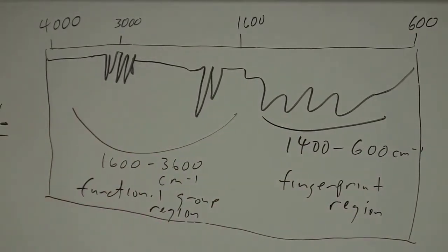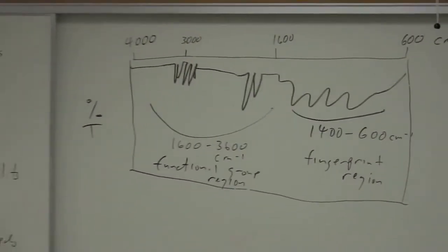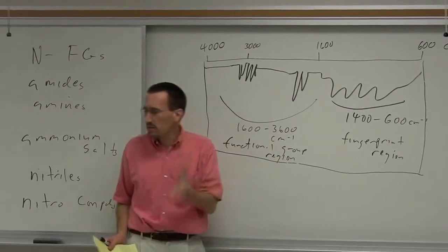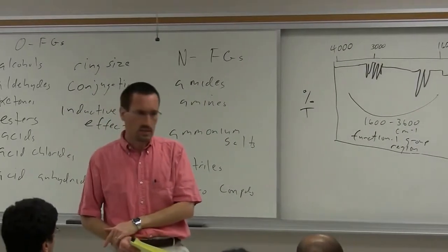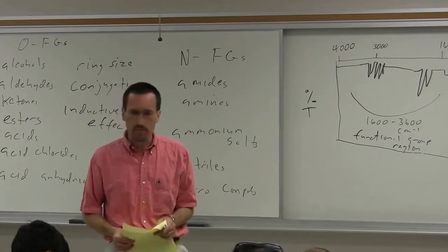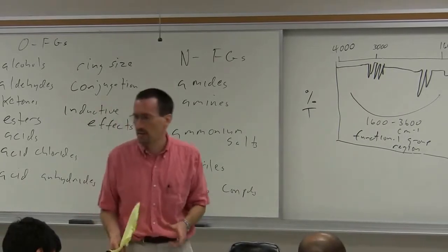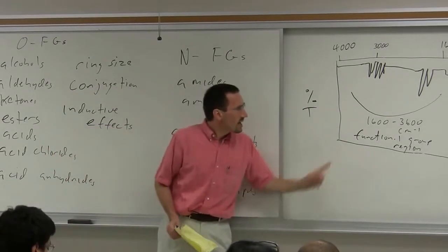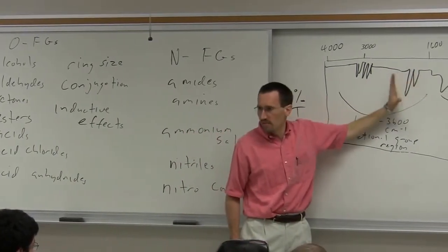If we have a chance, maybe on Wednesday we'll take a look at how you can find aromatic substitution patterns from here. I think in one of the homework problems, there's the textbook, by the way, take the time to flip through it. It's got very nice appendices. They're extremely useful. One of the appendices, for example, will give you some correlating peaks to be able to figure out what the substitution pattern is on an alkene, whether it's terminal, whether it's cis, whether it's trans. Anyway, so generally my eye will be drawn to this region above 1600.